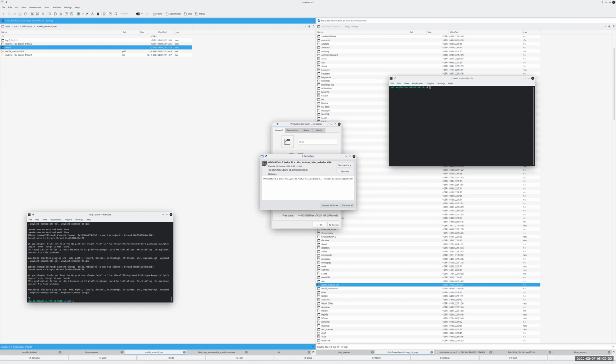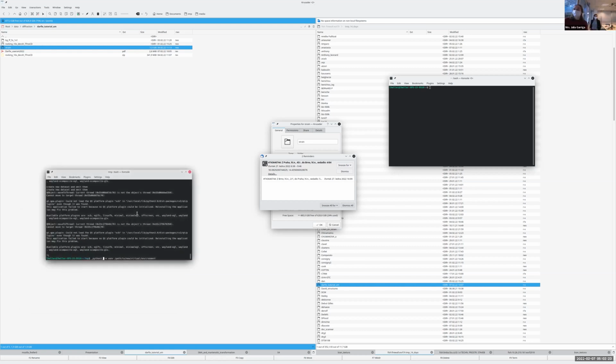So the virtual environment is this one. Can you see it? No, now you cannot see it. You can see my console. Ah, the console, yes. Is this what I'm supposed to do, and then the path? Yes, the path to the new virtual environment. But I should choose some path. You have to create a folder first.